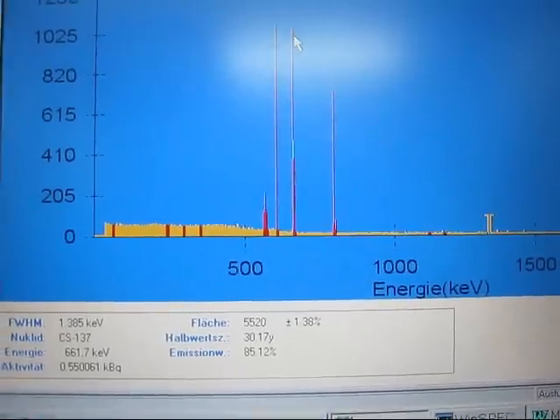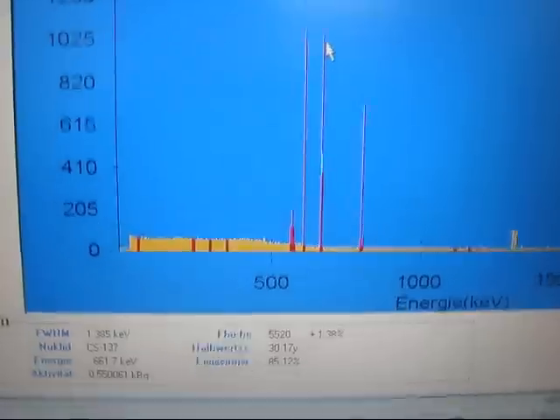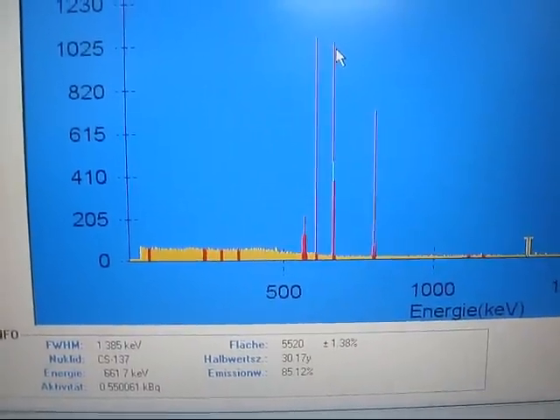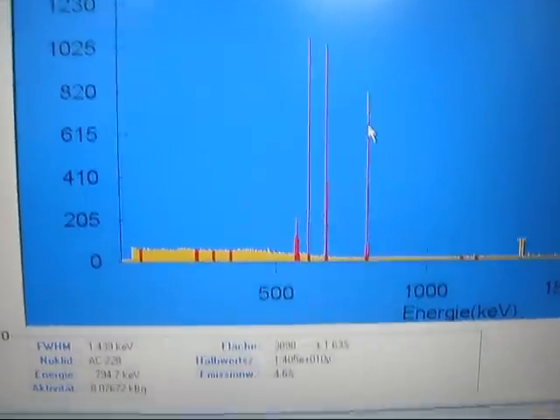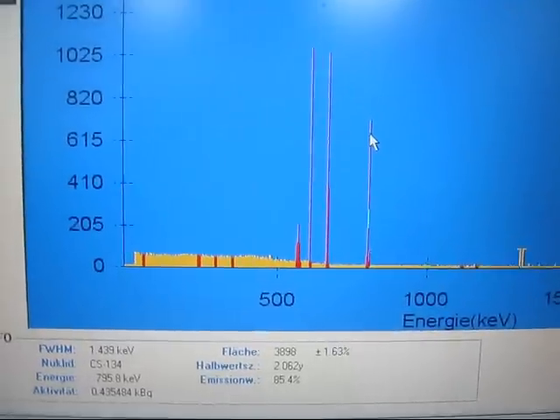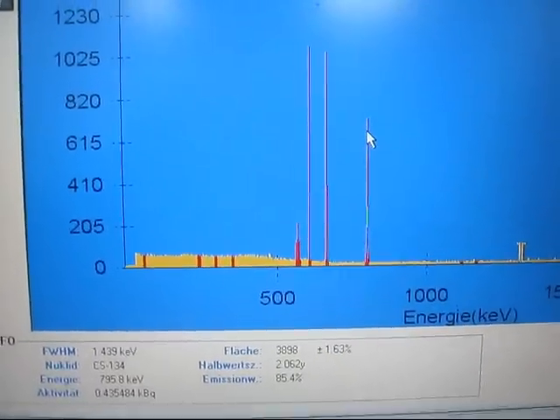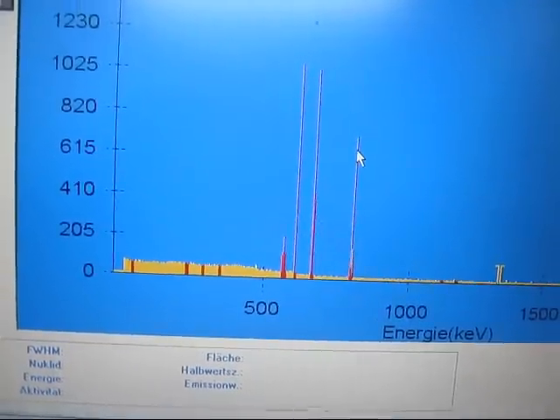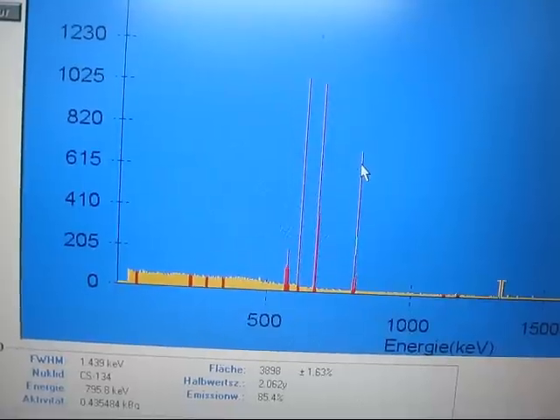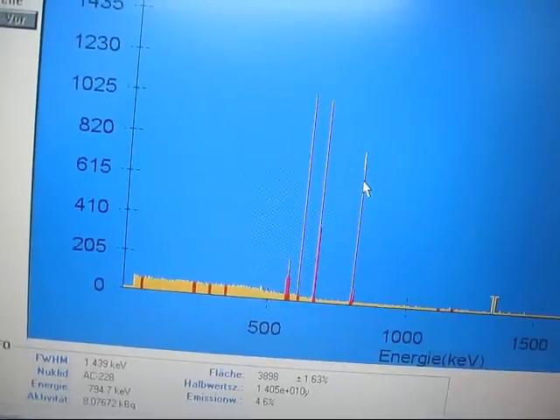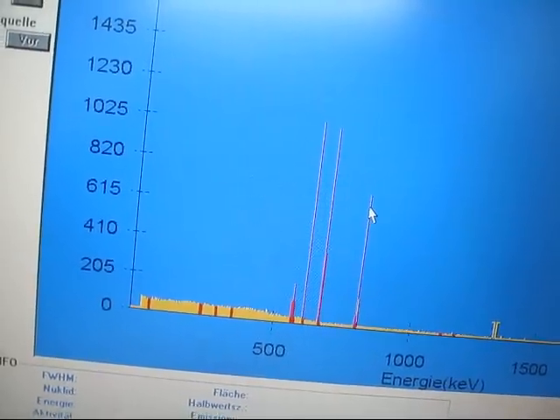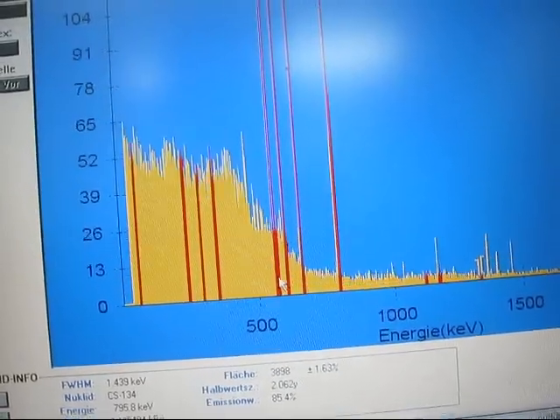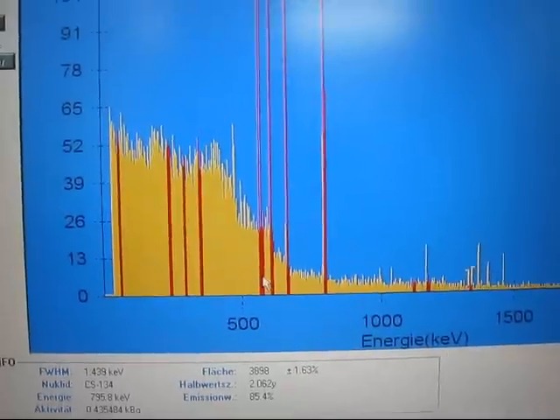It says cesium-137 here, with an activity of 550 becquerels, or 0.55 kilobecquerels. But it is important to note that this was actually done with the geometry calibration for a point source. So it can be quite inaccurate, maybe up to 50% inaccurate, as we do not have the proper geometry calibration for this yet. We get significant peaks, but don't take the stated activity for granted.